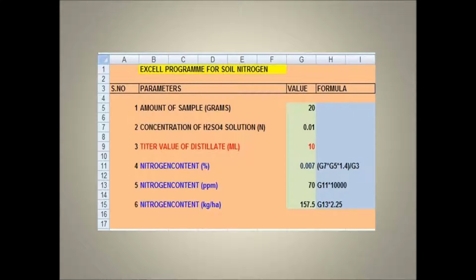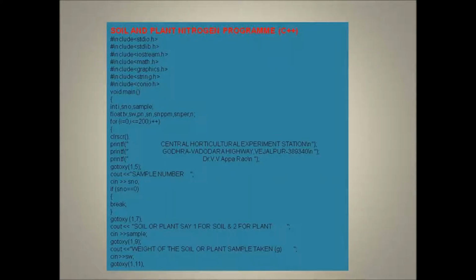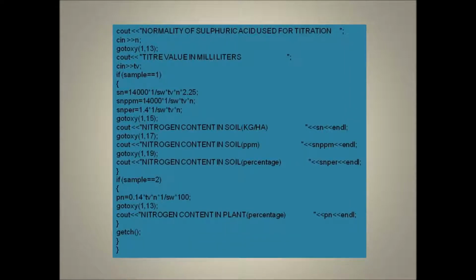Another program also we have written in C++, that also we will see. This is the program for calculating available soil nitrogen by the Subbiah method, and you can also calculate plant nitrogen. You can do it for both plant nitrogen as well as soil nitrogen by the Subbiah and Asija method. I wrote a program in C++. This is the script. When you write this script and compile it, you will get the executable program. Then you can use that program to do soil available nitrogen by the Subbiah and Asija method.